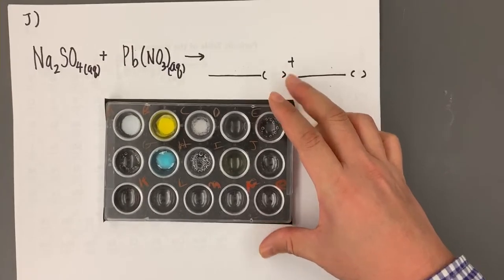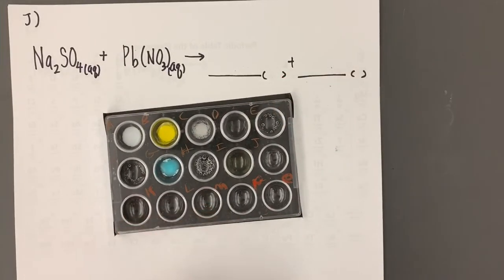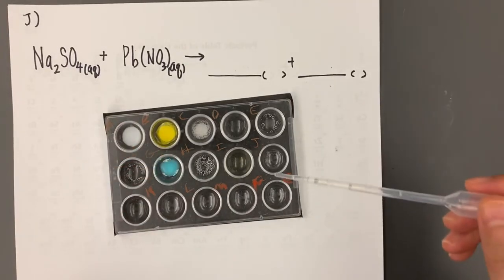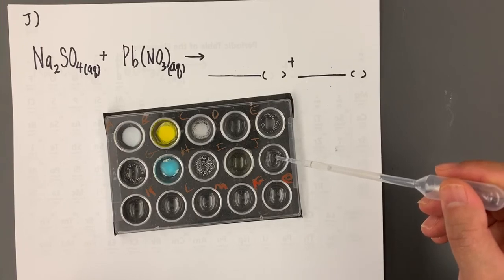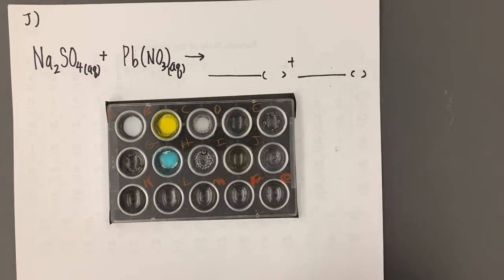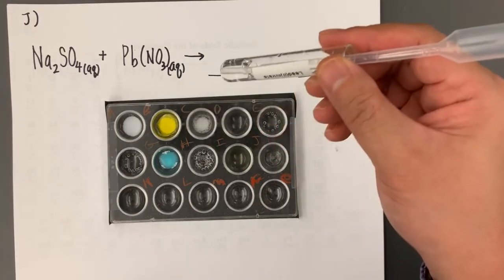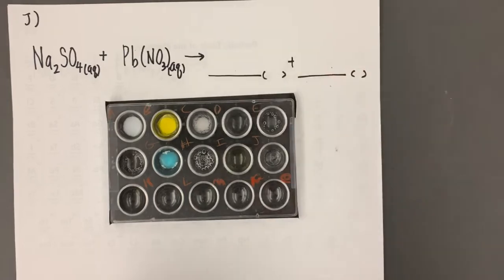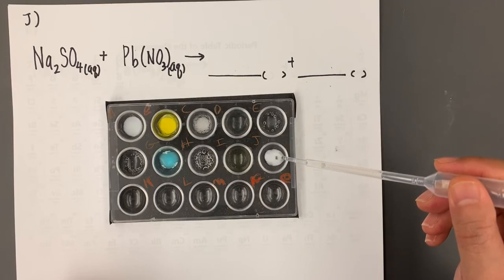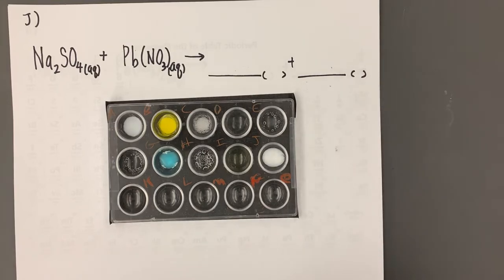Next, we're going to do sodium sulfate. Again, it's a clear colorless solution. We're going to add to that lead nitrate. We've used lead nitrate multiple times at this point. It is a clear colorless solution. And notice we have a solid that is formed.